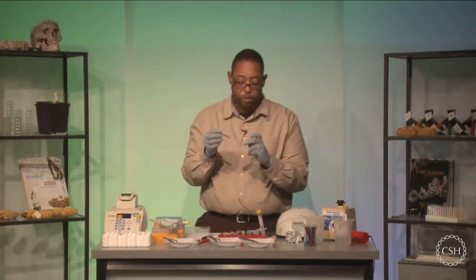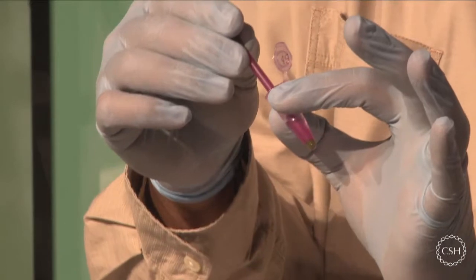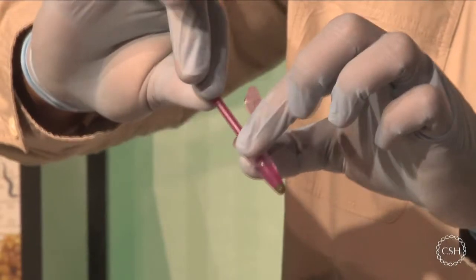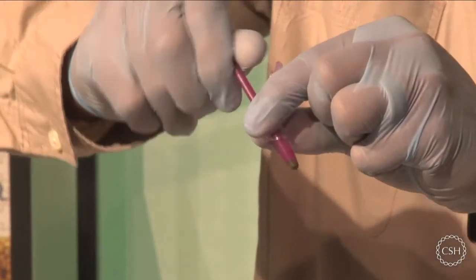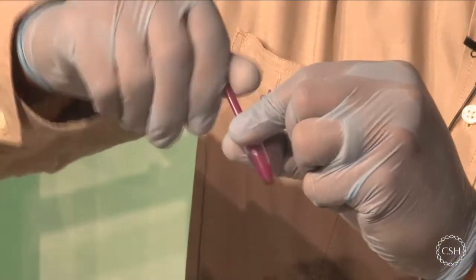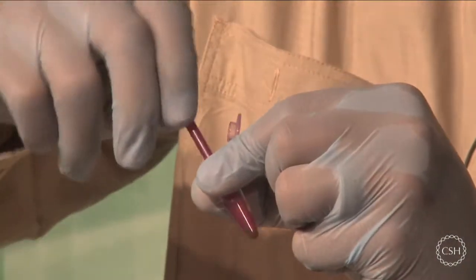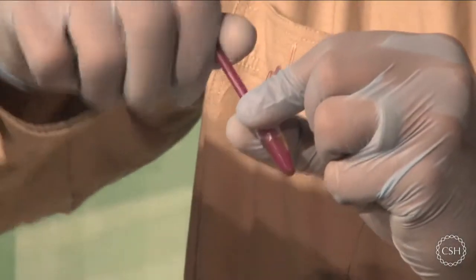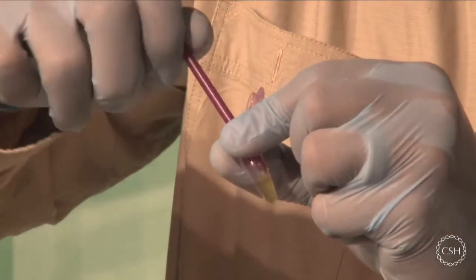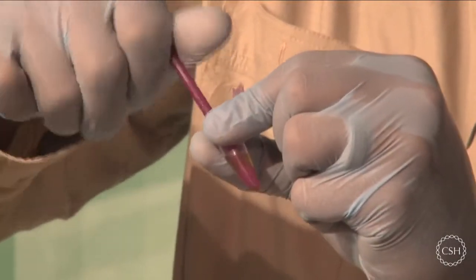So we're going to grind the tissue with our pestle here. Please make sure that the tissue is at the bottom of the test tube, and if not, push it down with your pestle. What I like to do is trap the sample at the bottom of the test tube, and then press really hard and twist. What you should notice is that the tissue starts to break up, and even the color of the sample will start to change. It will be releasing whatever is on the inside of your sample at that time. Since I'm using a plant here, my solution is starting to turn green. But your sample may turn red or brown depending on what other organism you're working with.